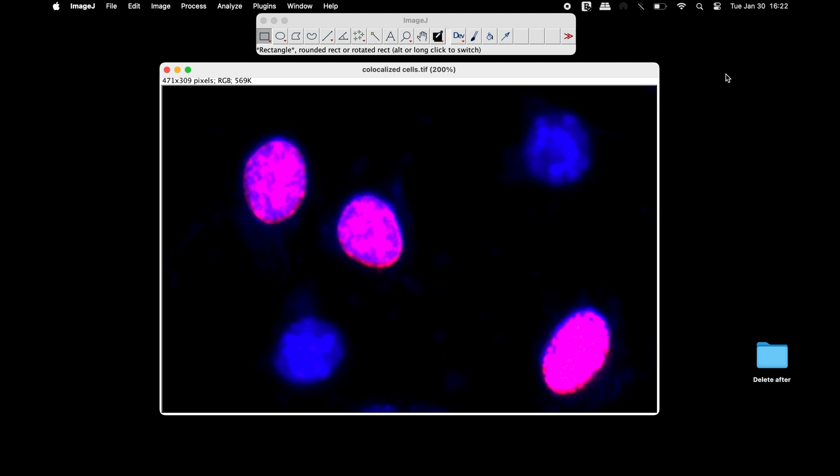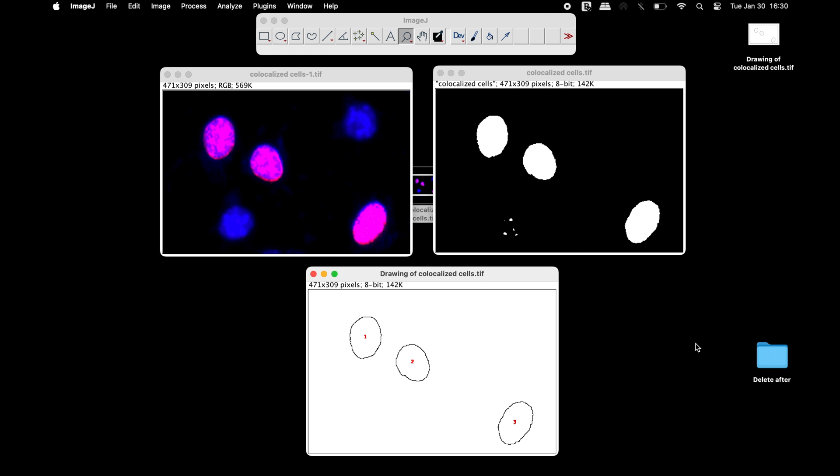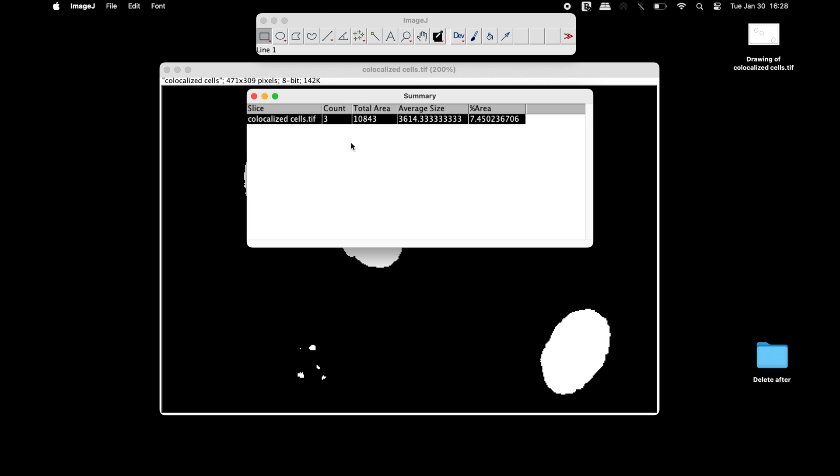We will count the number of co-stained cells, or double staining cells, using ImageJ.